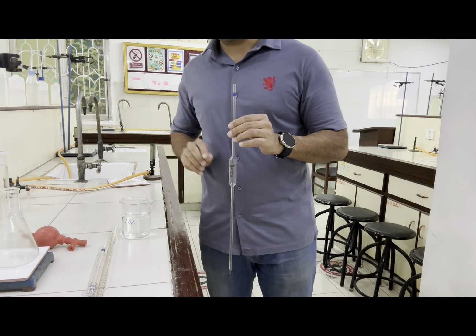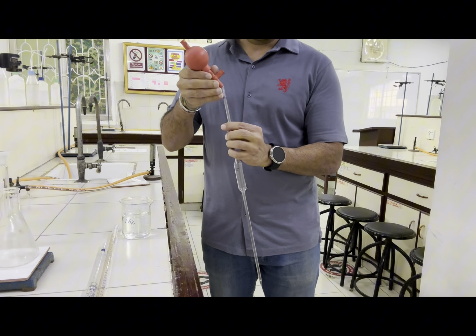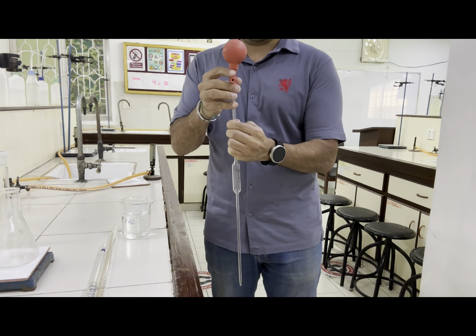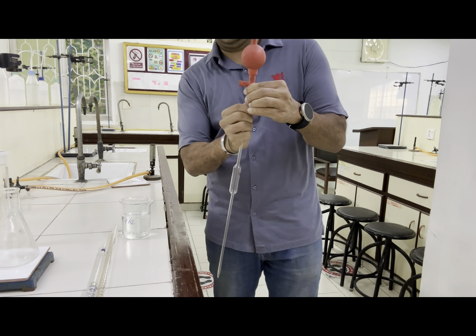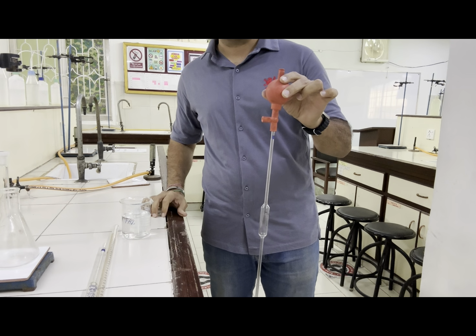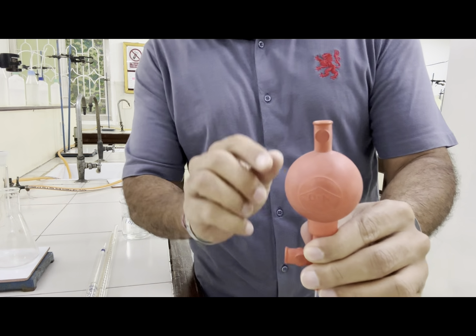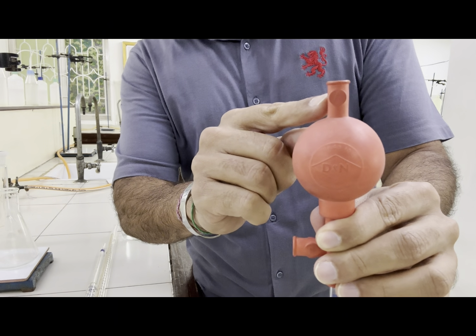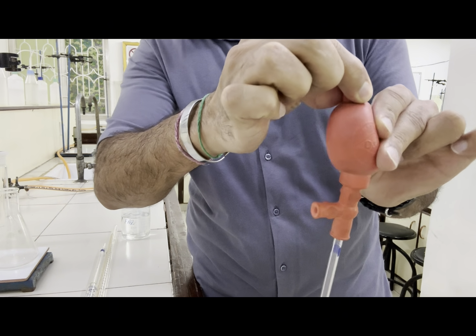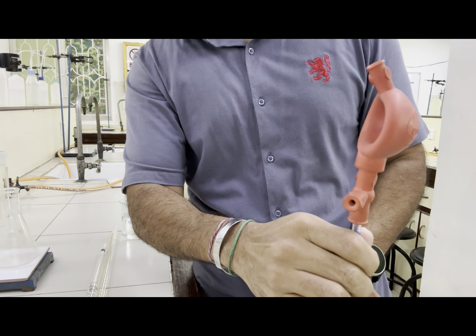First of all, for that we need to attach a pipette filler, and this is the pipette filler. Attach this pipette filler strongly so that it will hold the pipette by itself. Now this pipette bulb has 3 buttons. Number 1, A. When you press this A and squeeze this bulb, it will remain deflated.